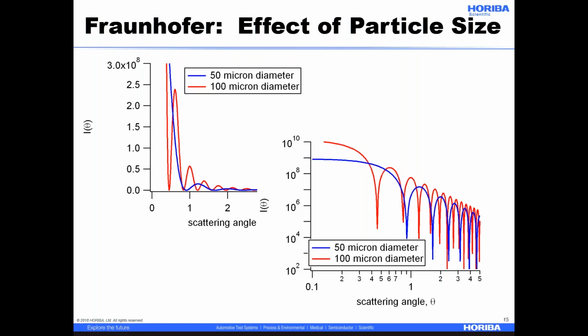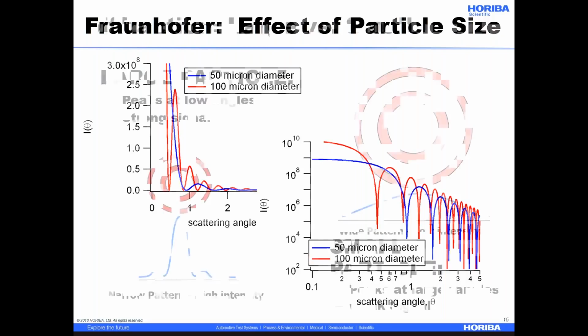And so this graph tells you why some of these instruments can get so heavy. We need to measure very narrow forward scattering angles, and that means that we need a very stiff optical bench. And so one approach to making a stiff and long-lasting optical bench is to add more metal. It works quite well. The only time you worry about that is when you go to lift the darn thing up. So anyway, think of this graph when you try to lift up an analyzer, and you understand what's going on. The other is, I now mentioned kind of a rule of thumb, larger sizes, smaller angles.